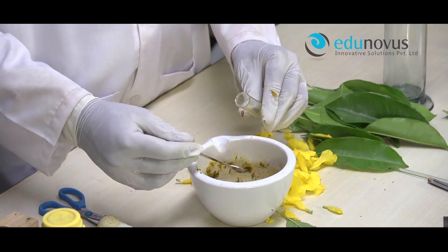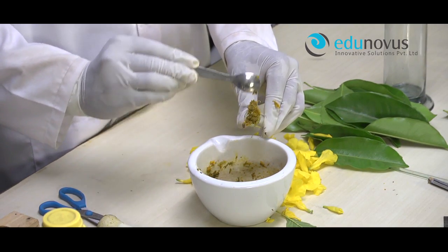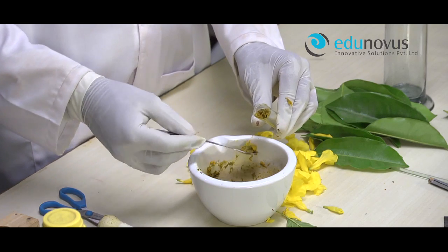Now take the flower extract paste into a test tube and add a few ml of solvent and shake it well.